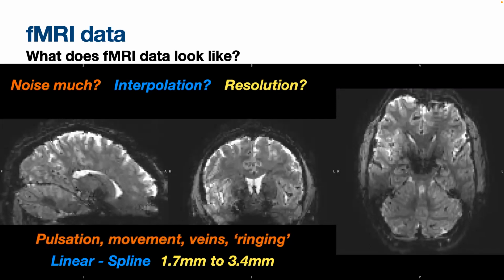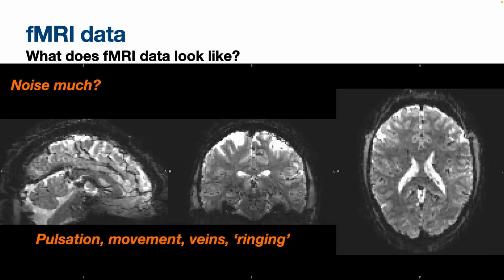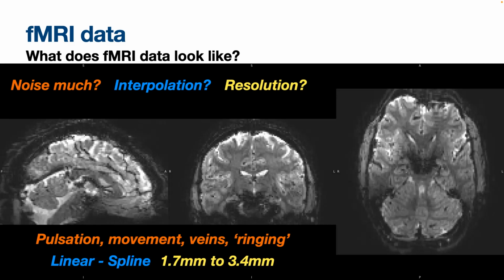Yeah. What you see here is that I'm changing the resolution from 1.7 to 3.4. And 3.4 used to be the sort of standard resolution 10, 15 years ago. Yeah. And did you see it go back and forth? I think this movie is a bit shorter or something. Oh man, there we go. So this is me changing the resolution to 3.4. So this is what we're working with now. This is what we used to be working with, right? You see that we used to be working with even worse quality, right?